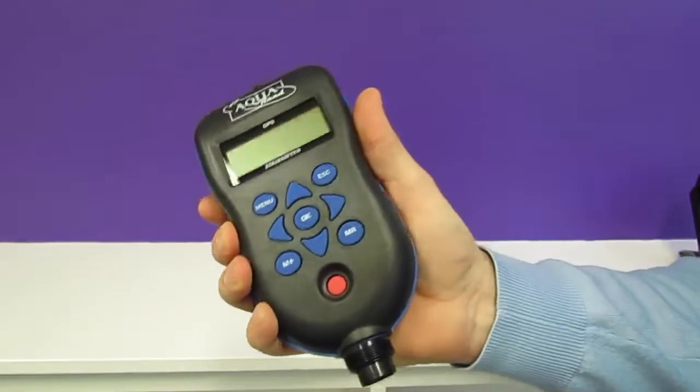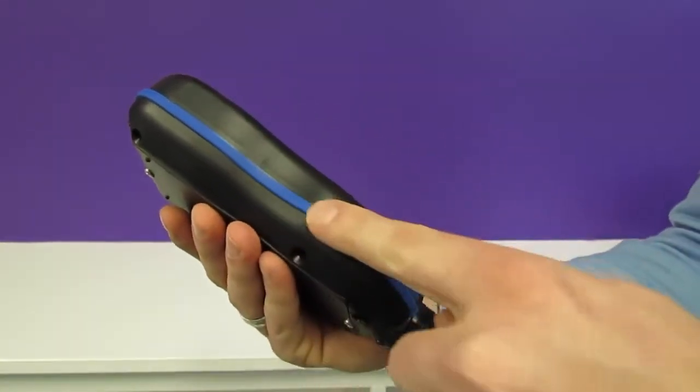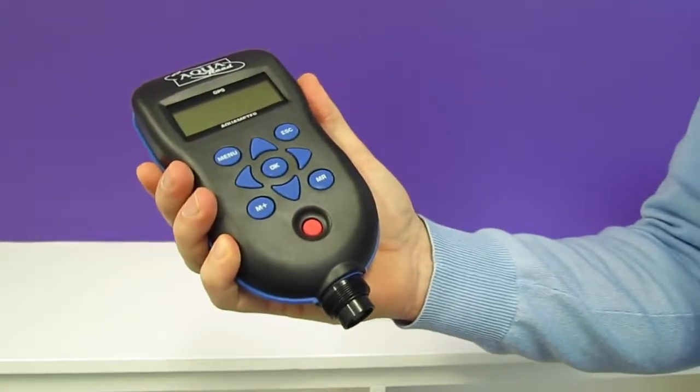The meter sits very well in the hand and is ergonomically designed. It features a rubber gasket that runs the length of the meter to help keep it in your hands even in wet conditions.